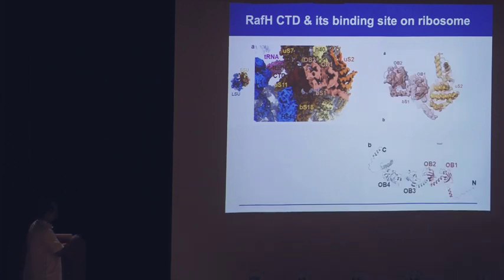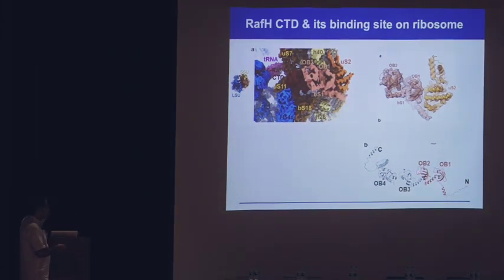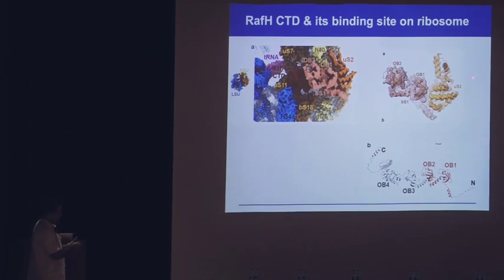And this is something that we saw for the first time, we showed that S1 is involved in the hibernation. This is S1, this is S2, this region fitted, this region fitted, and this AlphaFold gave us this structure, and the 2 domains are nicely docking.